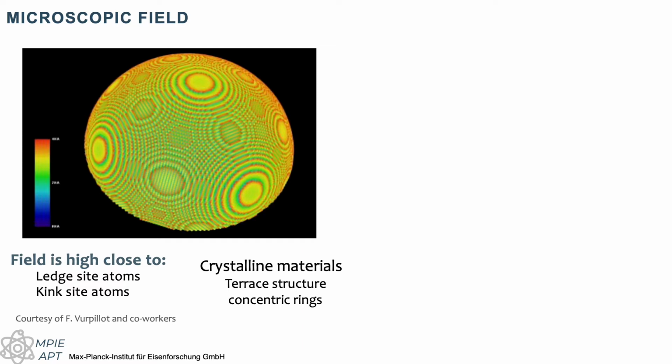So when you're looking at the intersection of a curved surface with a crystalline lattice, there will be a certain distribution of the field that reflects the local topography of the surface. And in that case, it actually highlights the position of certain sets of crystallographic planes and where they intersect the curved surface of the specimen.